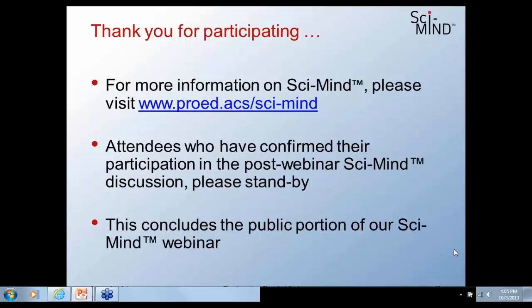But at the same time, depending on the conditions you're using, the higher flow rate, the trade-off will be to your benefit to go to the higher flow rate. The big detail on that, and that's actually a great thing to be involved in the Sci-Mind group, because we do a little bit more theoretical detail. But definitely check the chapter on theory in one of the good books.